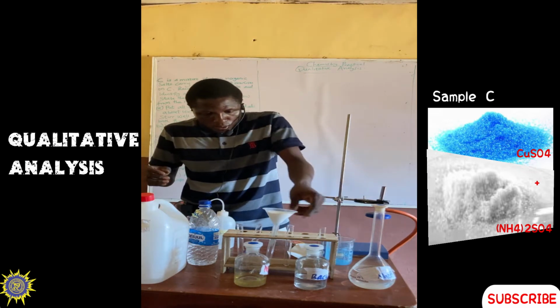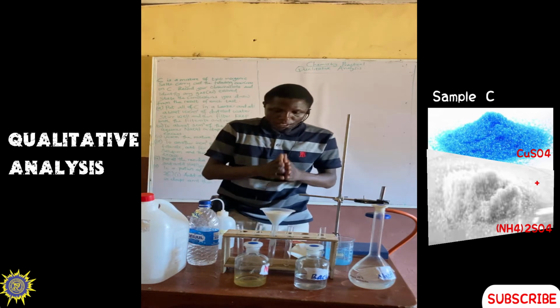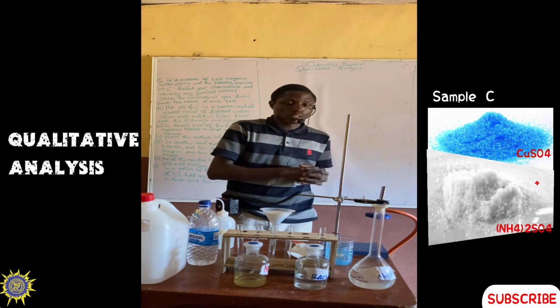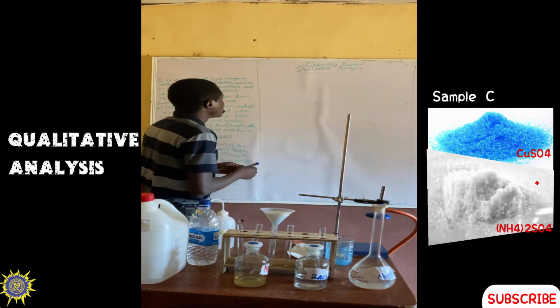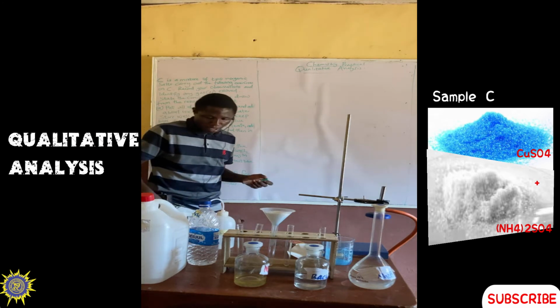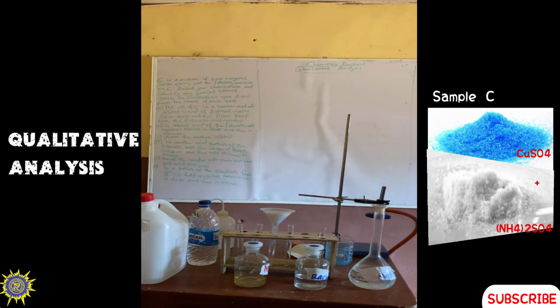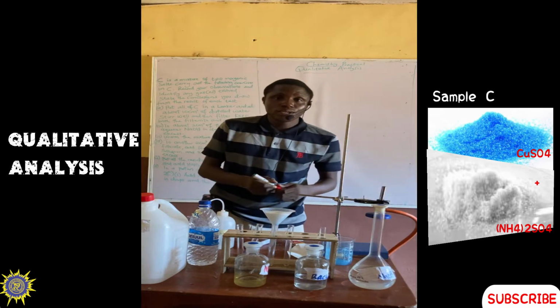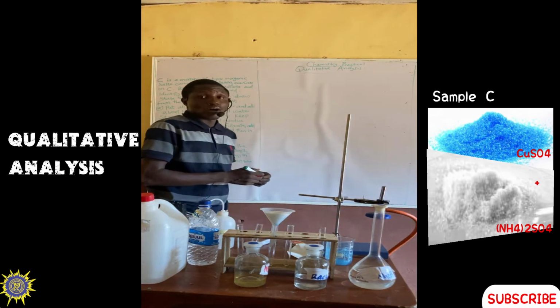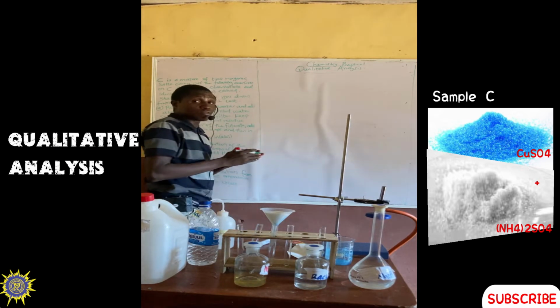While we wait for the filtration to be complete, I would like to continue with the table. So let's prepare the table. Now let me get my card so as to draw the table. The filtration is ongoing now. Let's draw our table out. The first thing is you have to draw your table. You must create 4 columns.